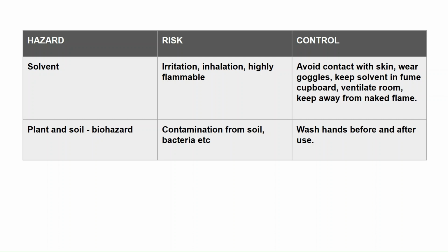So to control that, it's important that you keep away from naked flames. Keep solvent in a fume cupboard whilst you're not using it, and also open windows, just generally ventilating the room that you're doing your experiment in. And also the general stuff like avoiding contact with skin and wearing goggles and gloves, things like that, really.